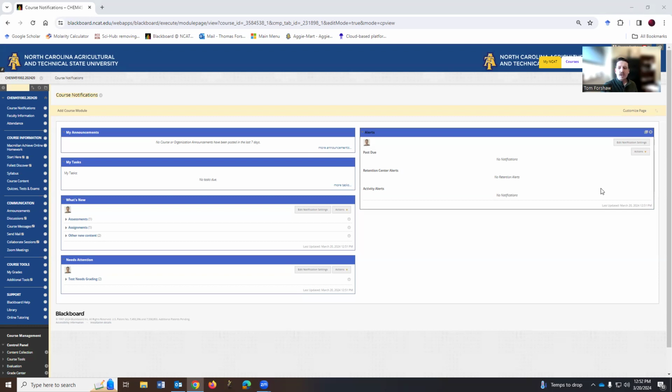So a dry lab is different from the usual wet lab in that it's a kind of investigation similar to a laboratory, an investigation done on a computer instead of in a regular wet laboratory where you might do, for instance, organic synthesis or something like that.